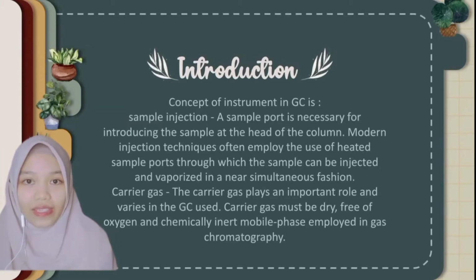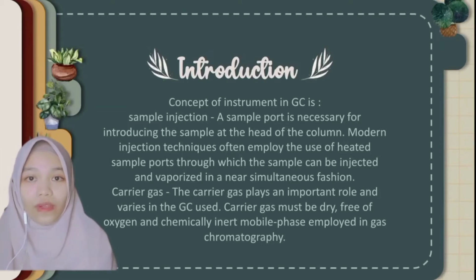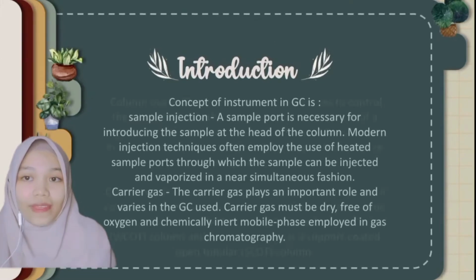Second, carrier gas. The carrier gas plays an important role and varies in GC use. The carrier gas must be dry, free of oxygen, and a chemically inert mobile phase employed in gas chromatography.